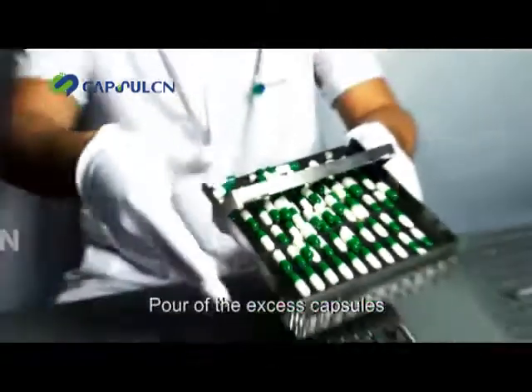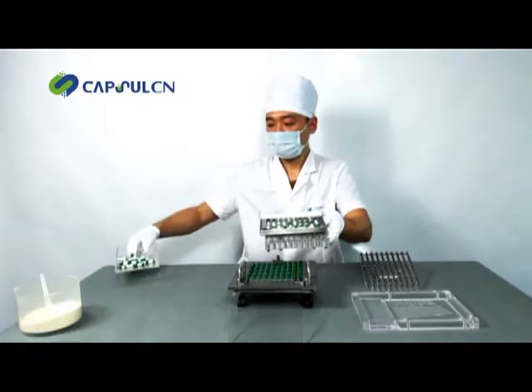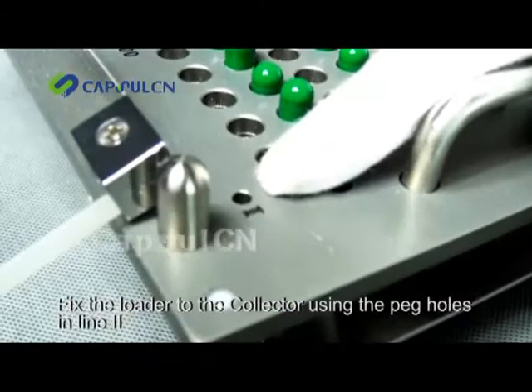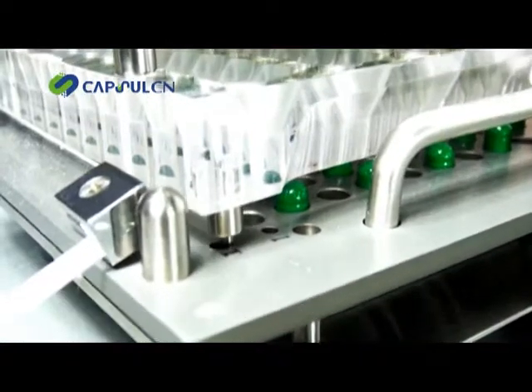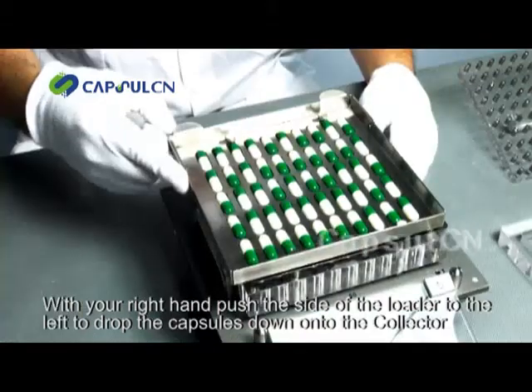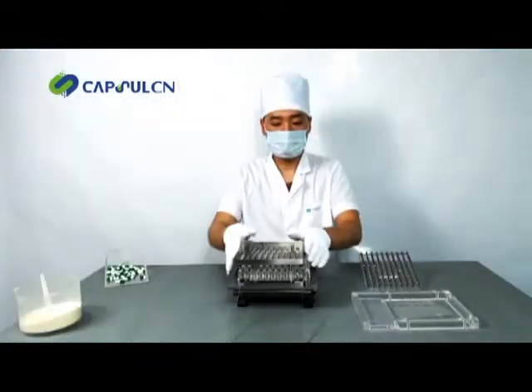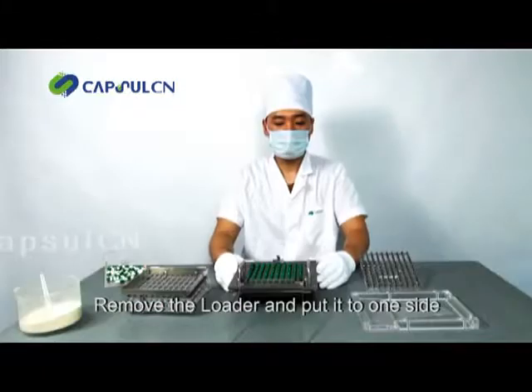Pour off the excess capsules. Remove the loader and put it to one side. Fix the loader to the collector. Use the peg holes in line two. With your right hand, push the side of the loader to the left to drop the capsules down onto the collector. Remove the loader and put it to one side.